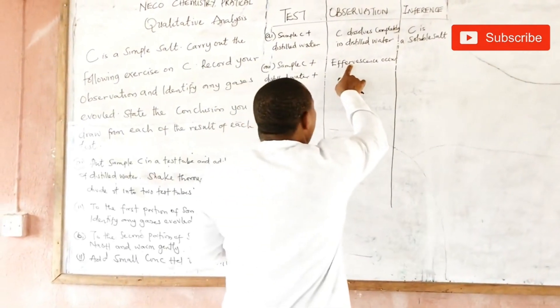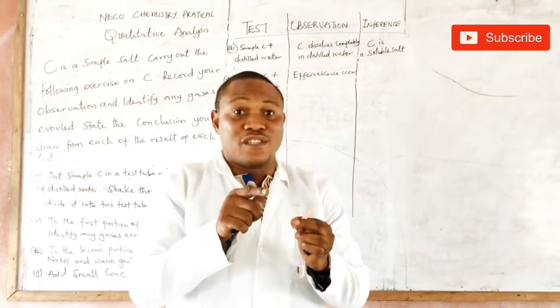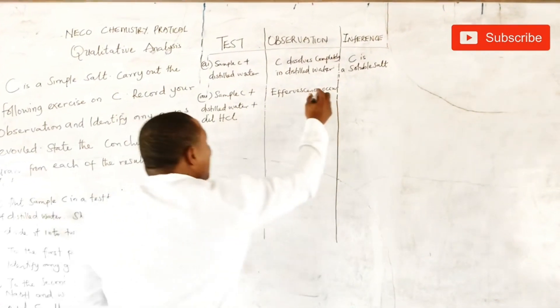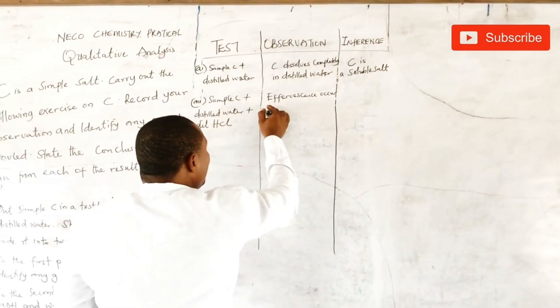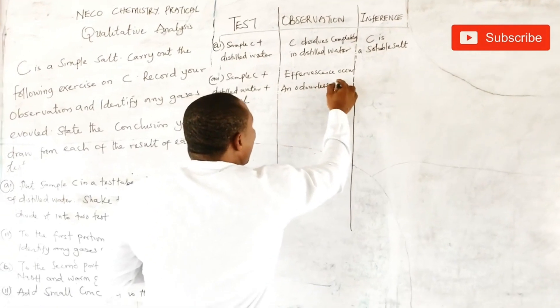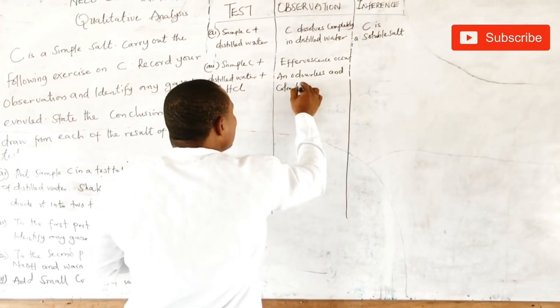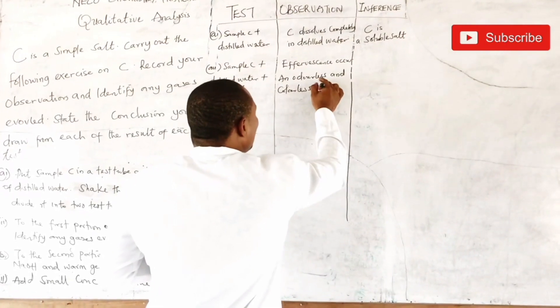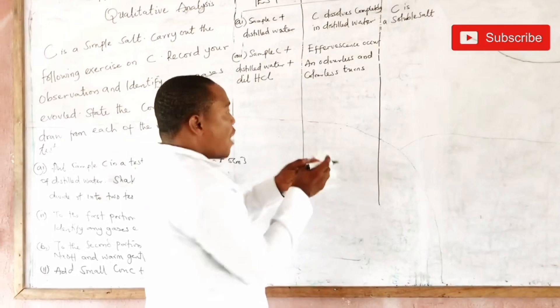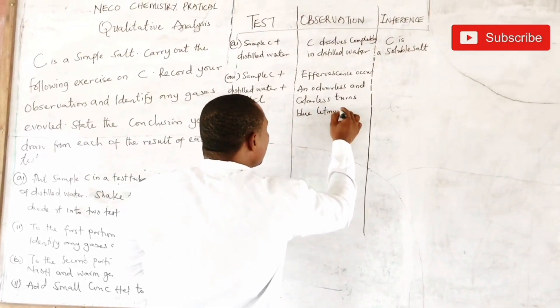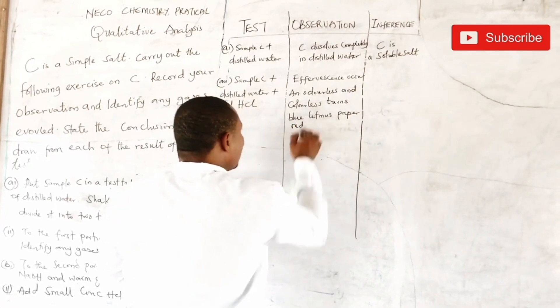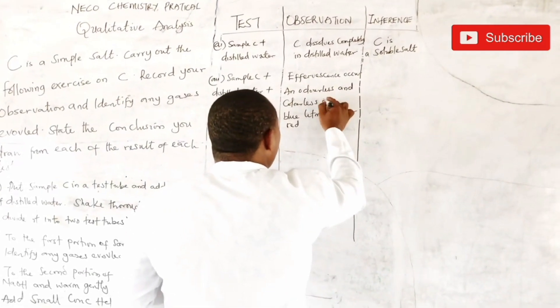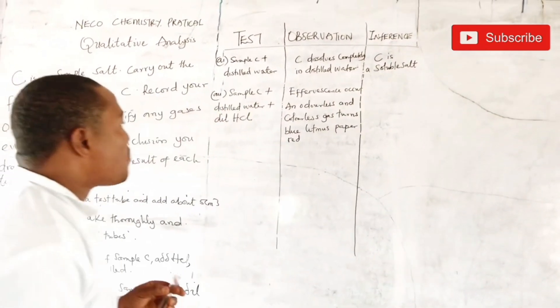You can see it's changing the blue litmus paper to red. So: effervescence observed. The gas evolved is odorless and colorless, and it turns blue litmus paper red.